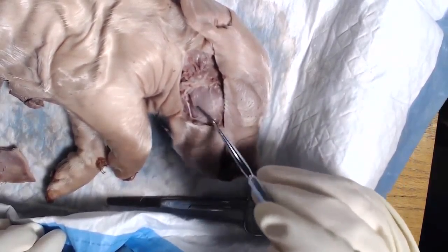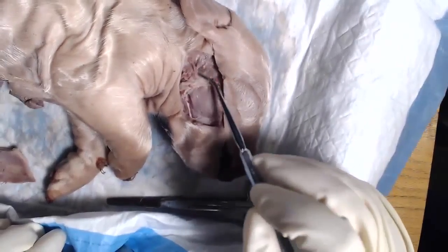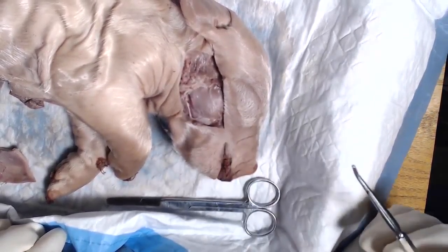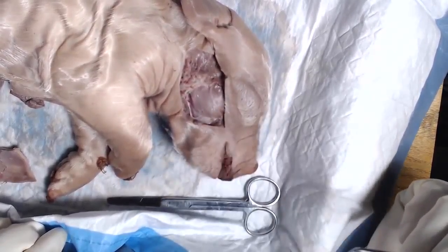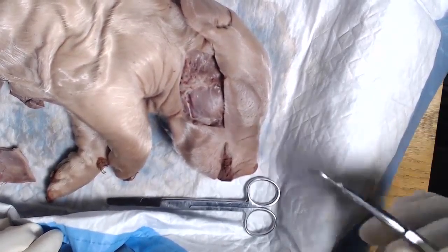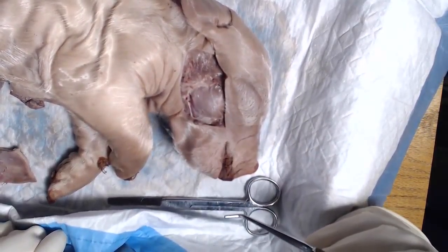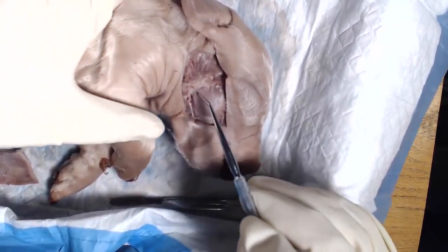So far we just have our masseter closest to us, and then the parotid just behind it here. And it's a pretty large gland. It's large but thin as well, so it might be easy to destroy it. Maybe if you weren't careful removing the skin, you may have already cut through it. Hopefully not. Okay, we'll go ahead and move on.